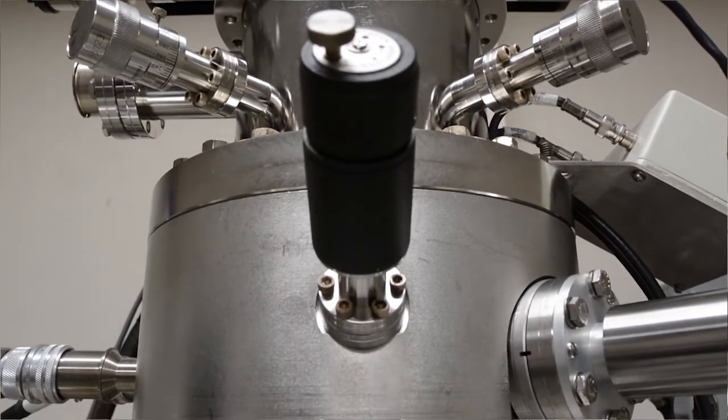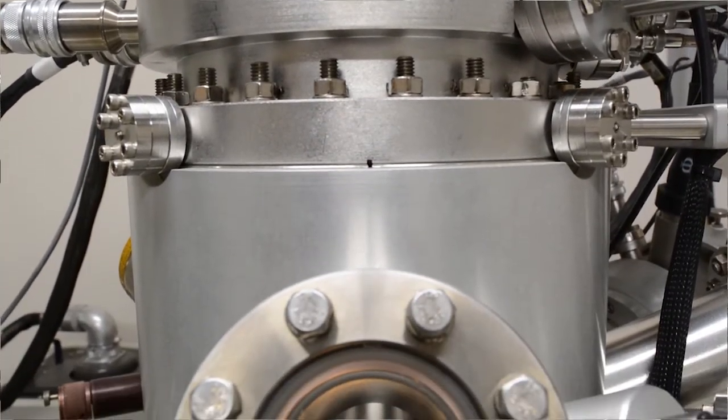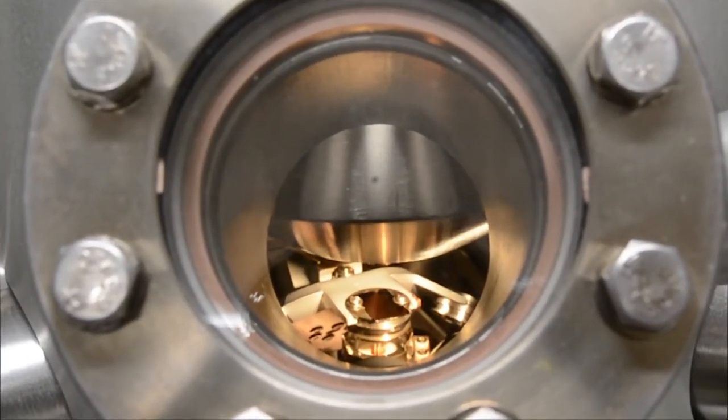And this here is our field emission Auger system. And it looks pretty cool. There we just saw the column and the analyzer, and now we're seeing the sample chamber. And so here we see the sample in the chamber, and we see the bottom of the analyzer, and that's how we do our Auger analysis.